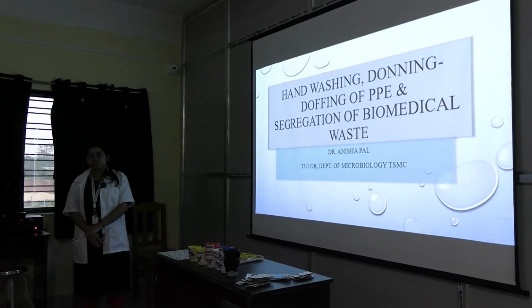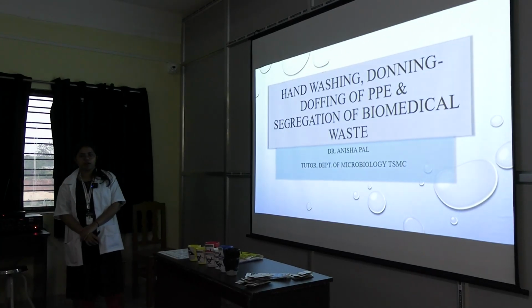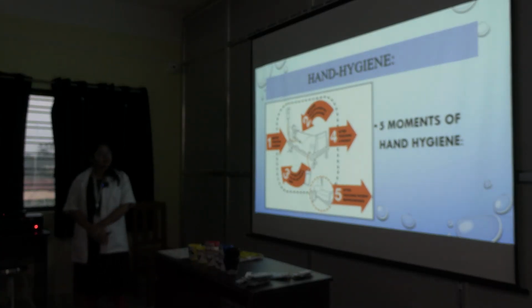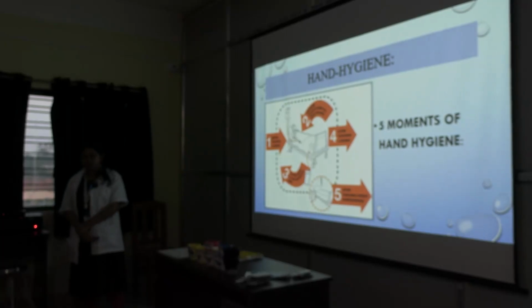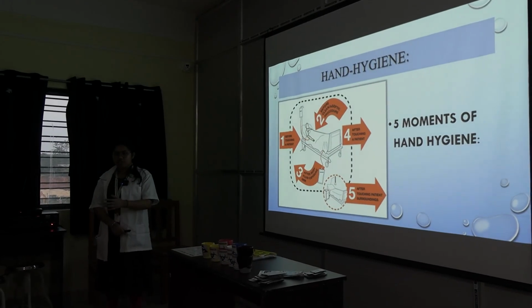Our practical topic is hand washing, donning, doffing of PPE, and segregation of biomedical waste. So, at first, we should know what are the 5 moments when we should be performing hand hygiene. Can you say what the 5 moments are?